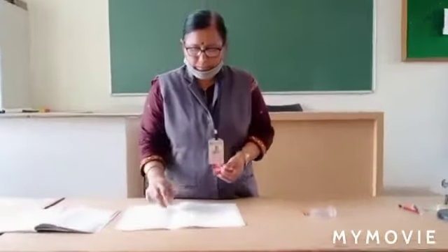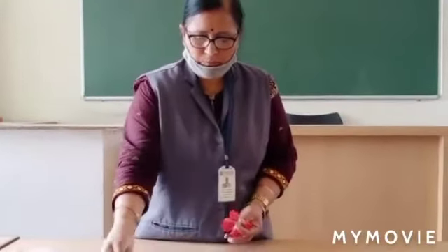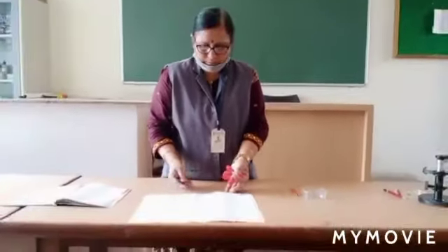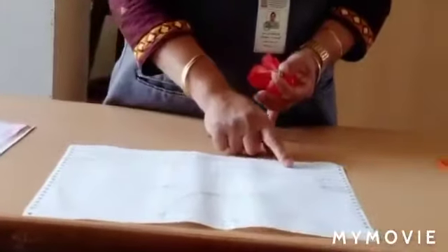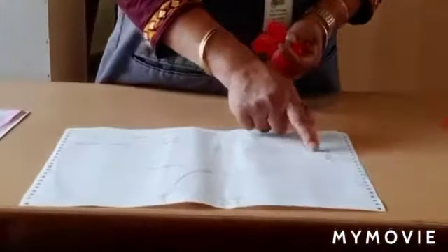Now we should cut open all the various whorls and display them on the sheet here. You can take a photo of this. On the display sheet, you will have to write all the names of the whorls, the units of each whorl, and draw the diagram.